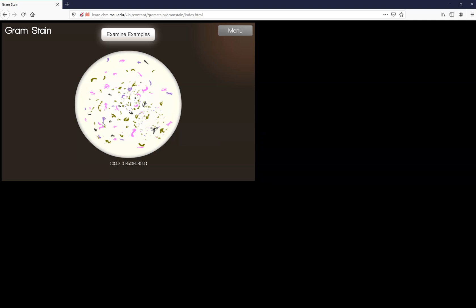Notice I see purple and pink. There's also some greenish brown in there which is fine. No big deal. If you don't get a view that looks like this at the end and all you see is all brown and all clear or you don't see pink and blue then you've done something wrong.